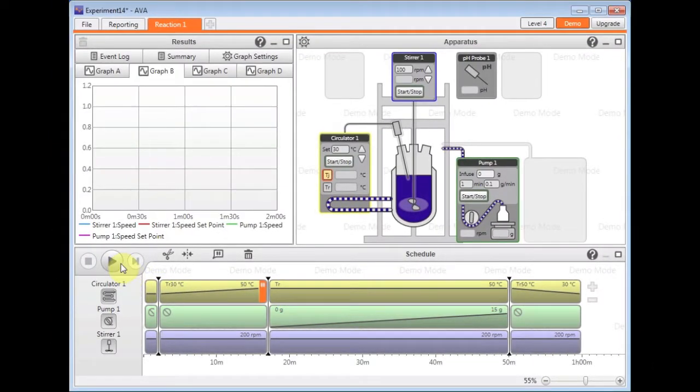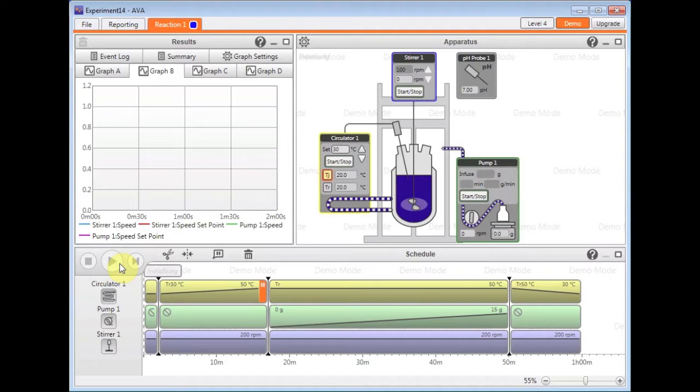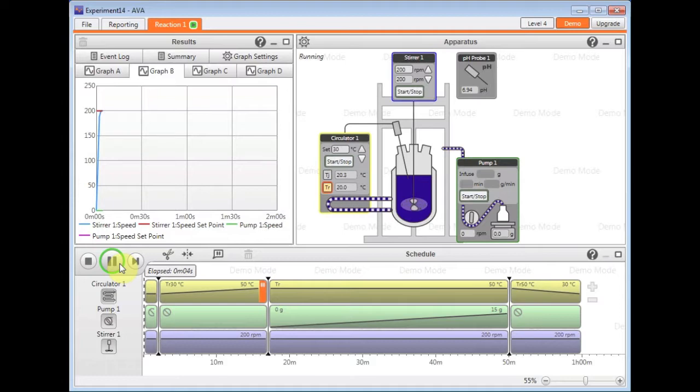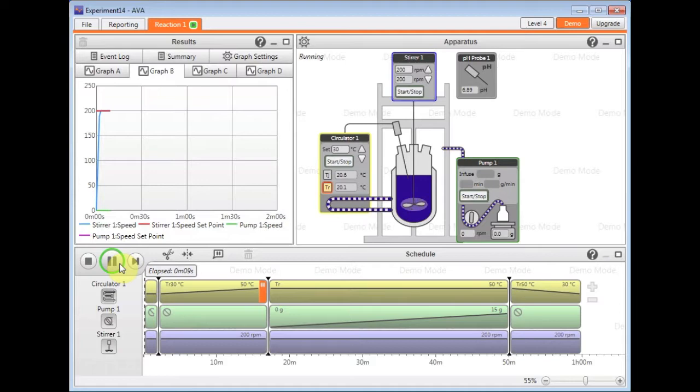I'm just going to push play on the schedule. The schedule will now automatically move through those steps that I've created, setting the apparatus to each of the values shown in each window there.